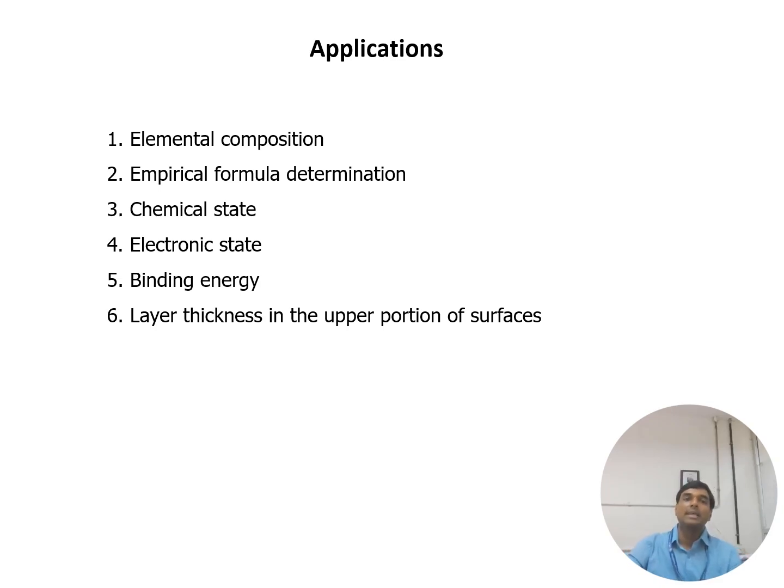So what are the applications? It can determine elemental composition, empirical formula, oxidation number, electronic state, binding energy, and of course the layer thickness in the upper portion of the surface. As I told you, XPS is highly useful for elemental composition. It can even detect which kind of atoms are covalently attached.